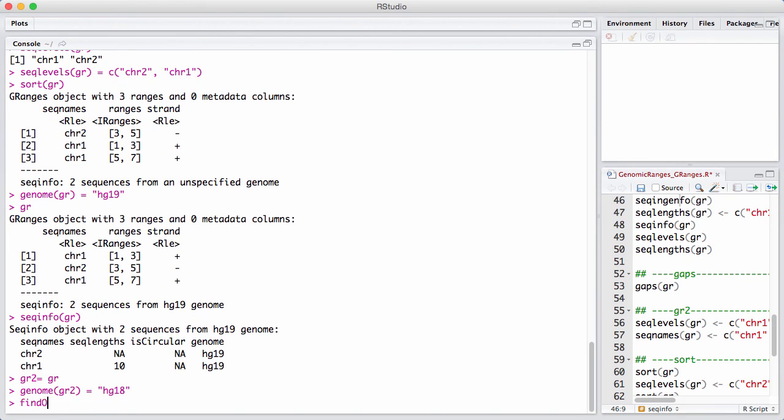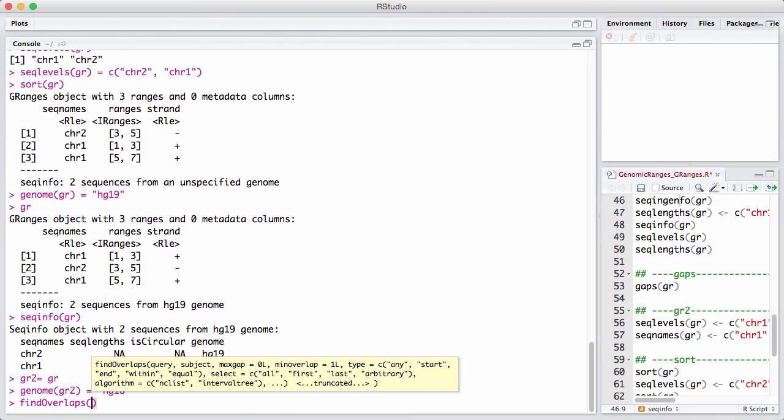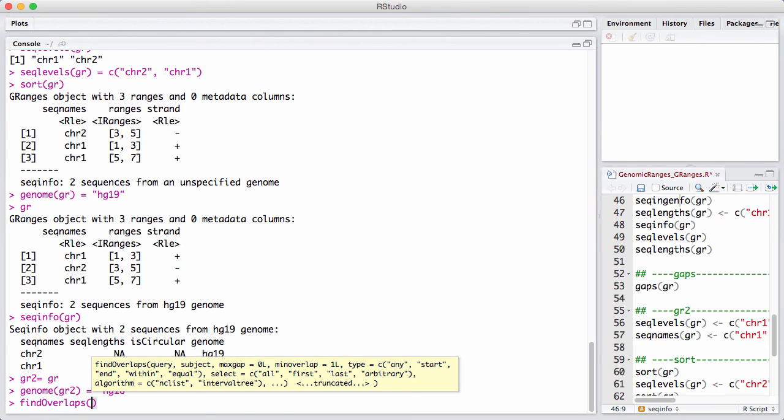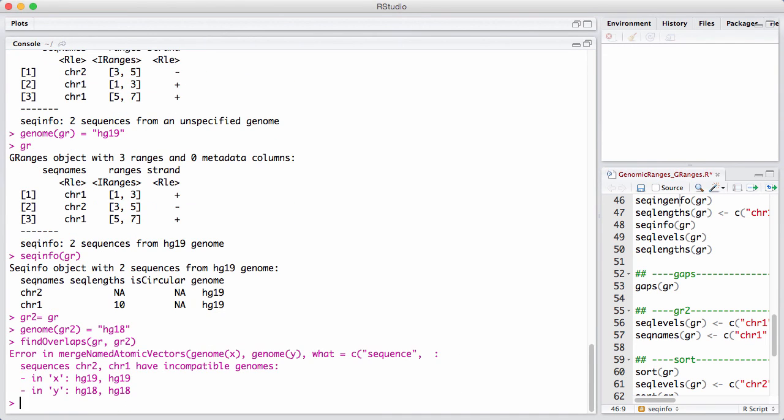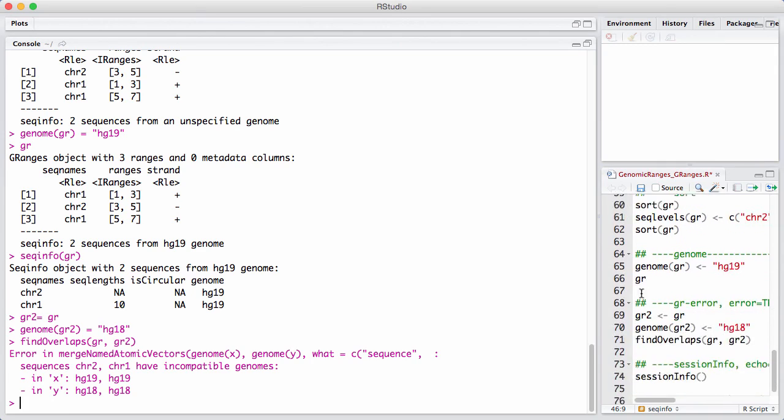Now let's do something like a find overlaps that we haven't really discussed fully. We will do that in a different session, but it works in the same way as the IRanges. And if we do that, we get basically an error out saying that we have to try to do a find overlap between two GRanges and they are incompatible genomes. That's a really nice safety feature that I would encourage people to make use of.